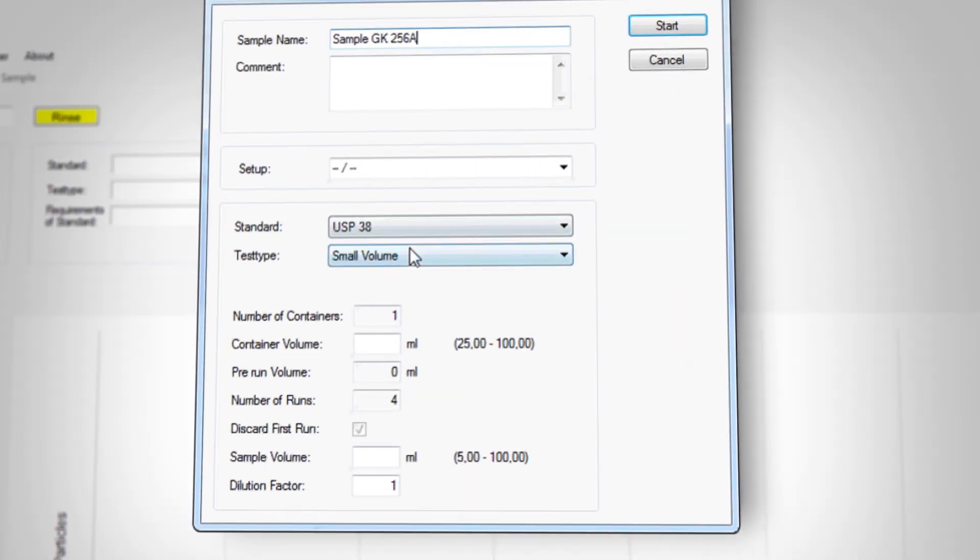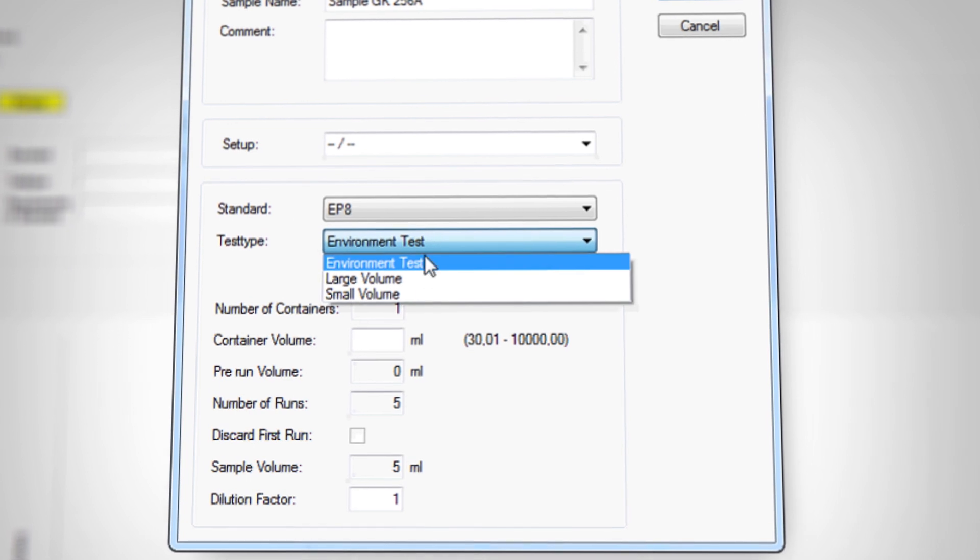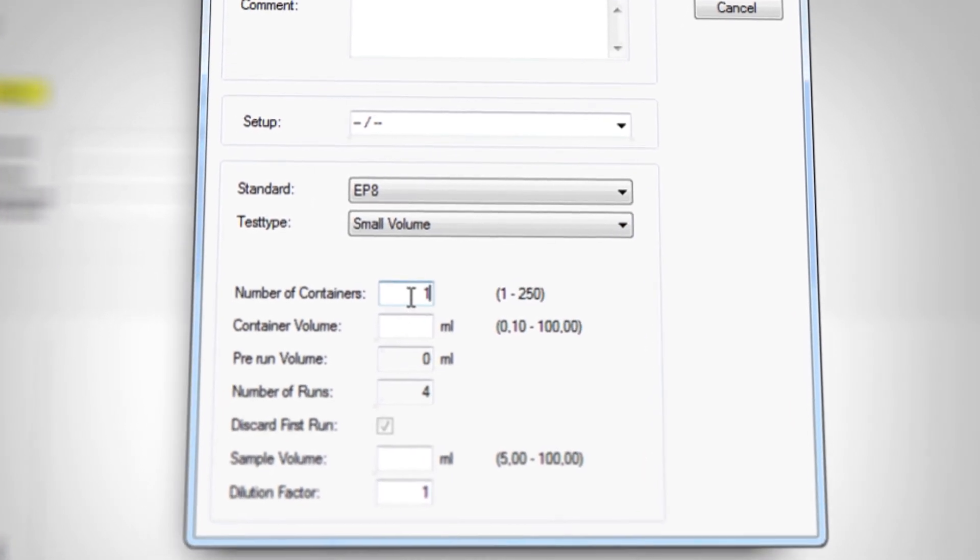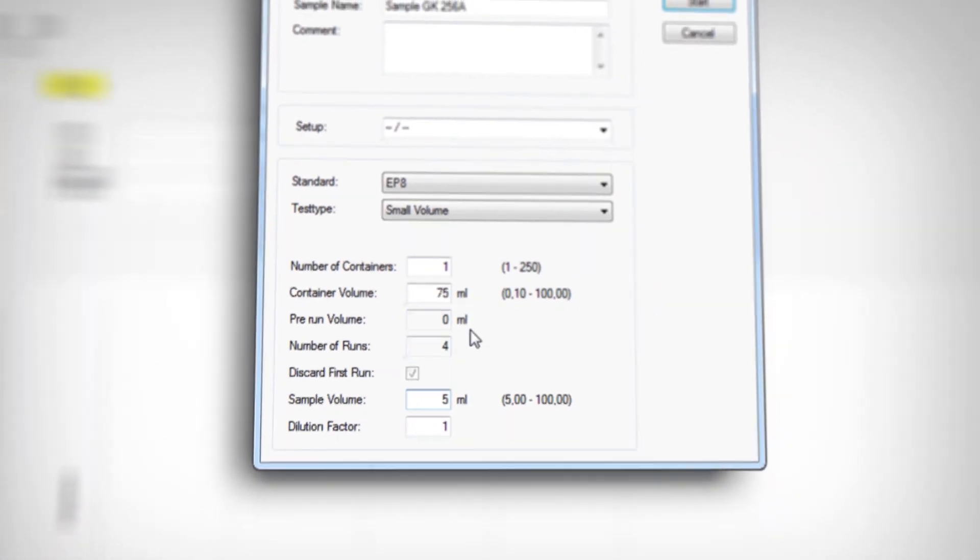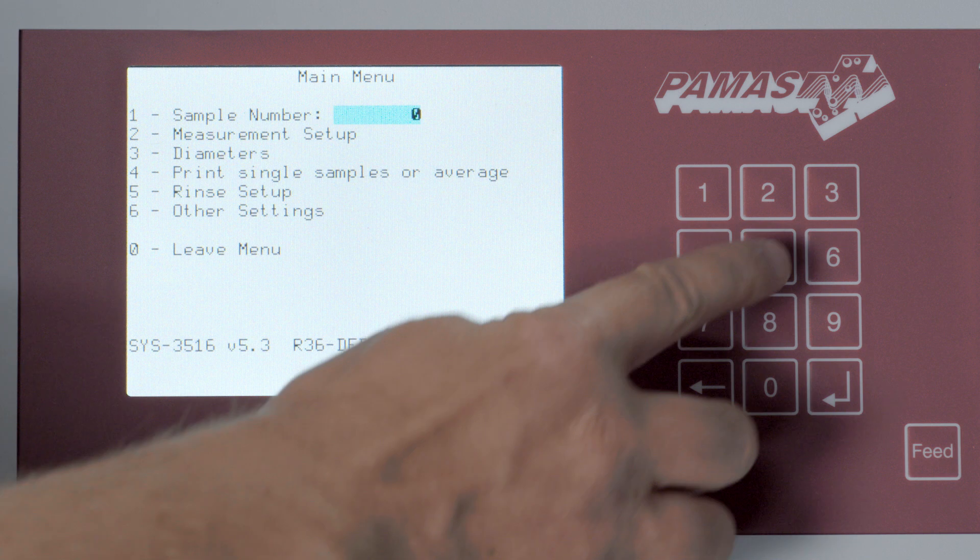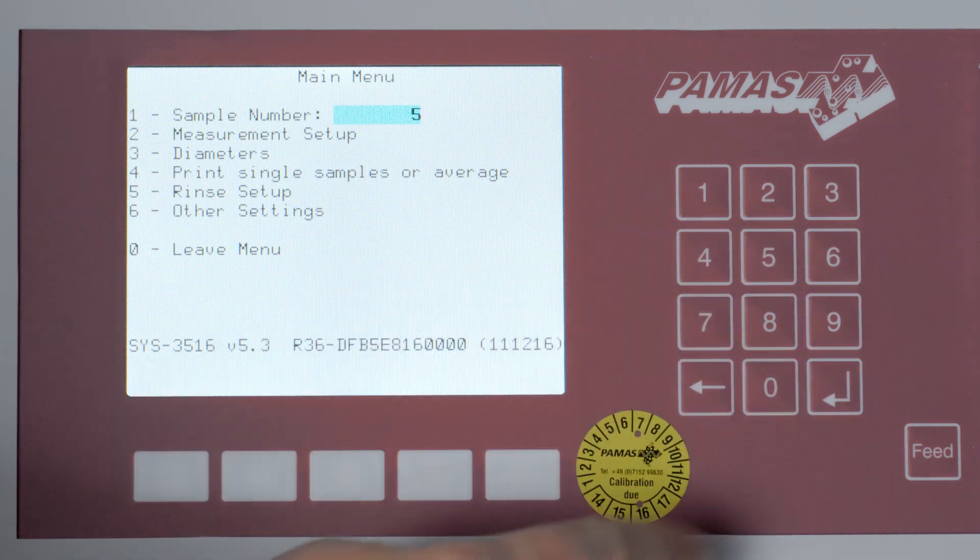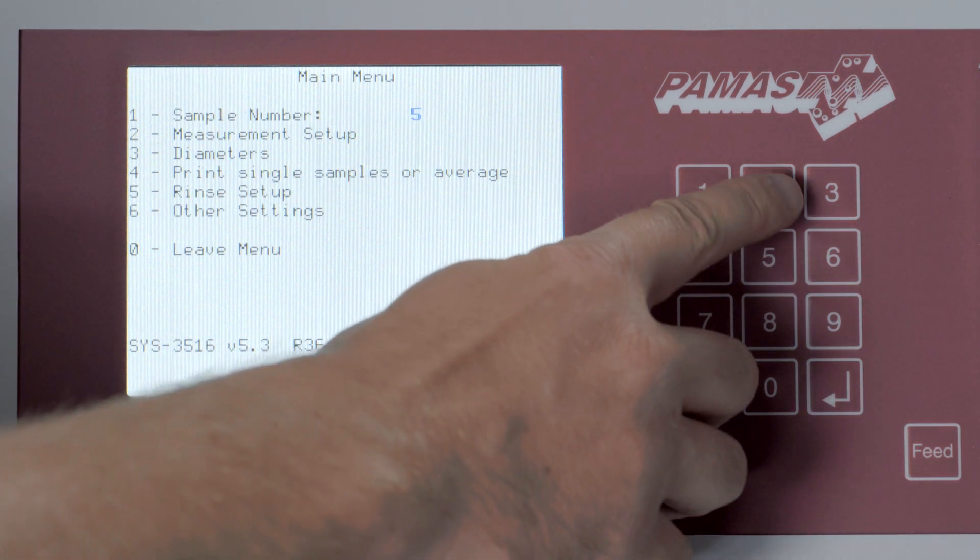All measuring parameters can be easily set up utilizing the software which is delivered along with the instrument. All settings can be made on the instrument's LCD monitor.